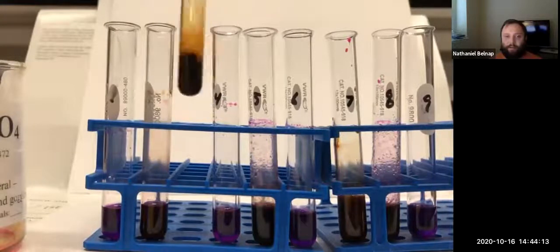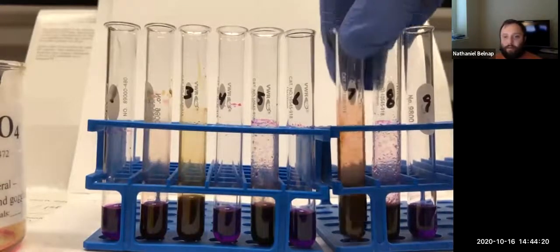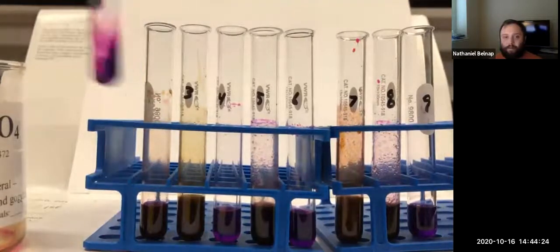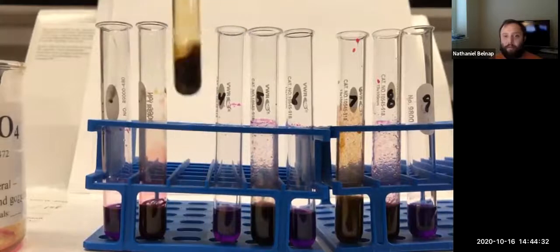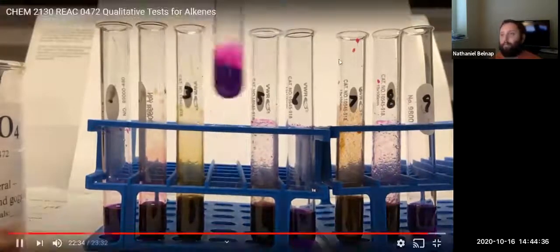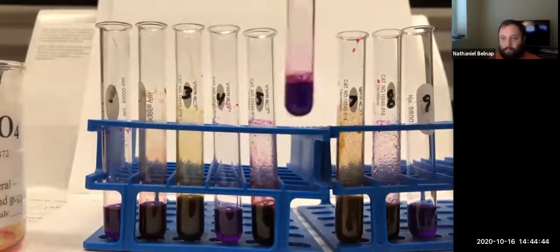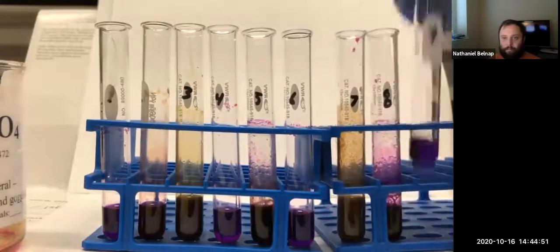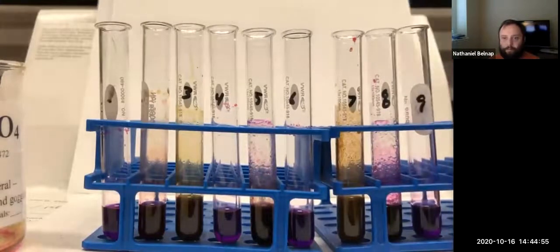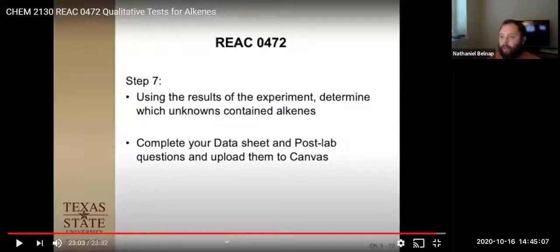Okay, yeah. Yeah, I see that. So yeah, you could definitely look at that and consider it unsaturated for sure. And also comparing that to number 4 and number 9, and number 6, those definitely you can tell are saturated. Yeah, for sure. So yeah, that's the end of that.